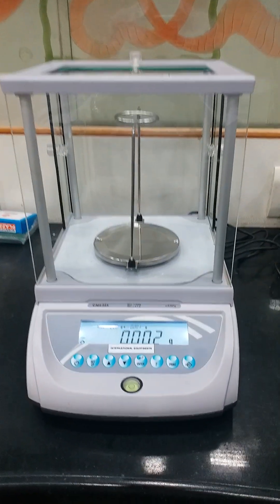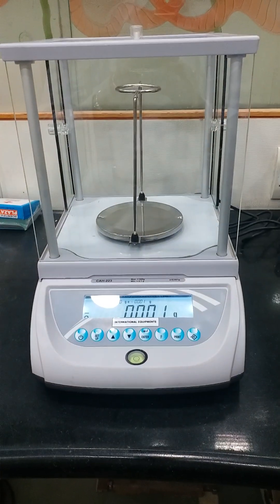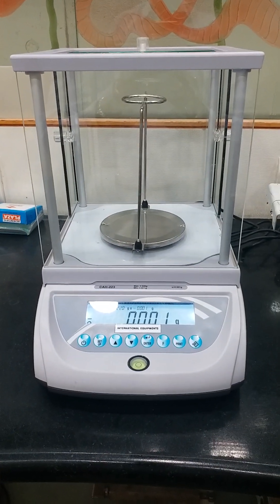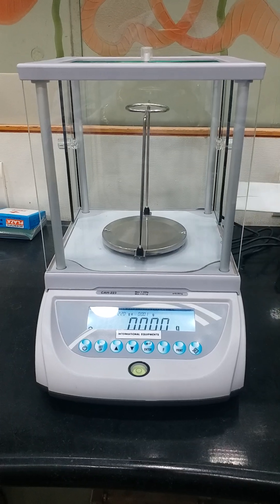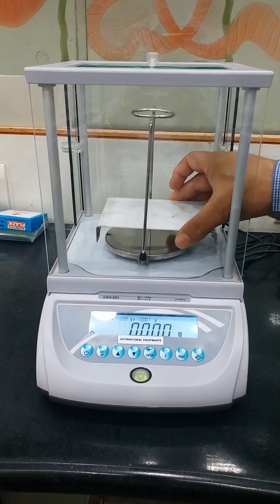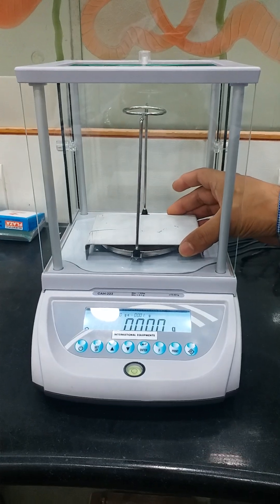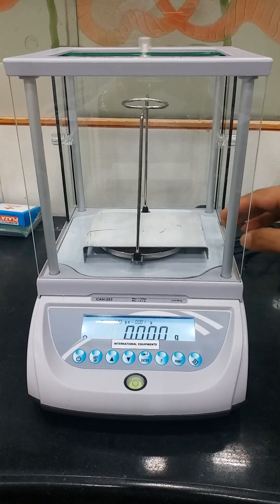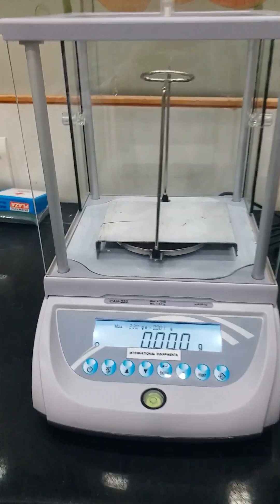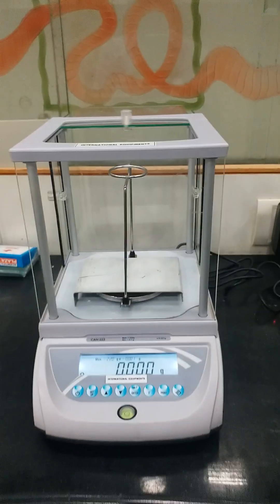The density equipment is ready for the trial. First, we have to do the mounting assembly. As you can see, we have fixed the pan. Now put the base plate. Make sure that the base plate does not touch the pan at all — it should be free. You can tell by the display: if the load remains zero, it is not touching. If it touches, it will show some load.